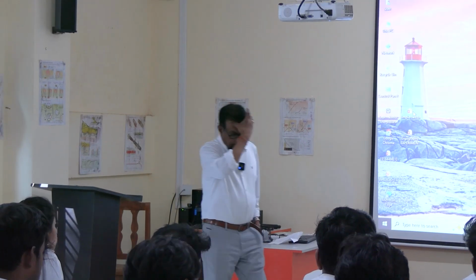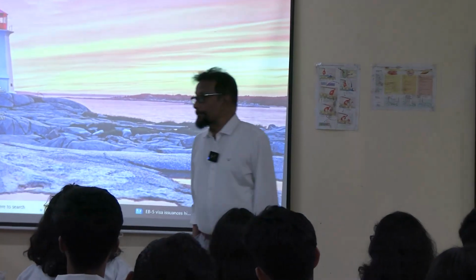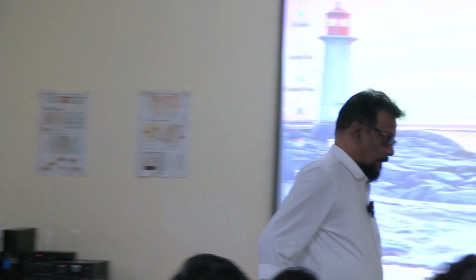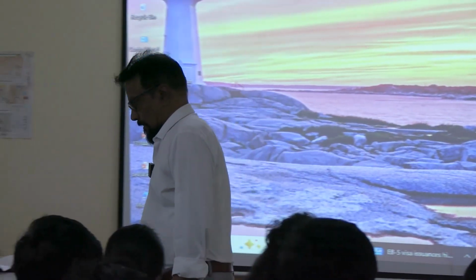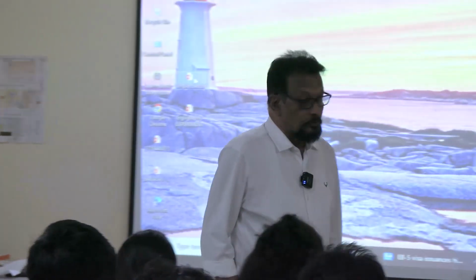Going to start our amphibian experiments. There will be two types of amphibian experiment. One will be on nerve muscle physiology. Another will be on amphibian heart. We will be studying some properties of nerve and muscles through these experiments, amphibian experiments, nerve muscle experiments.